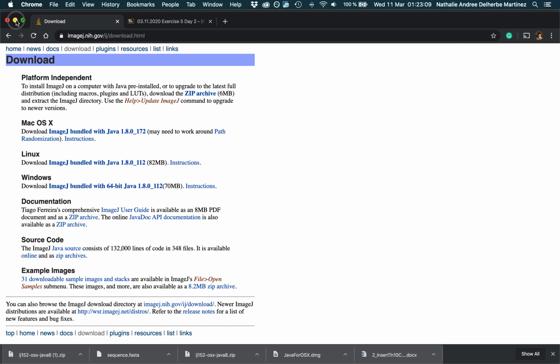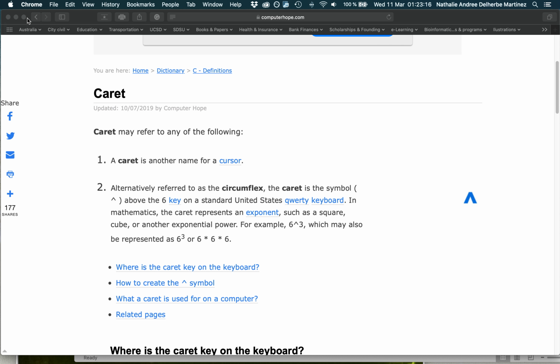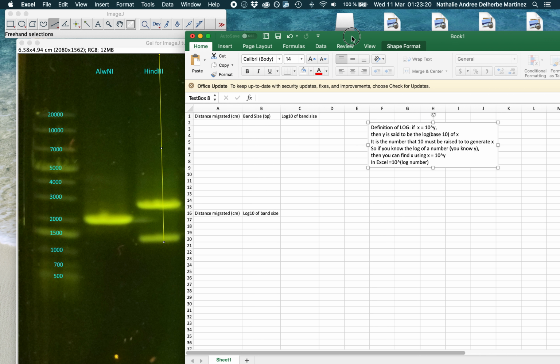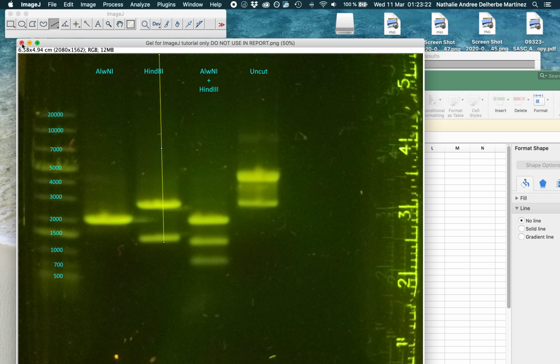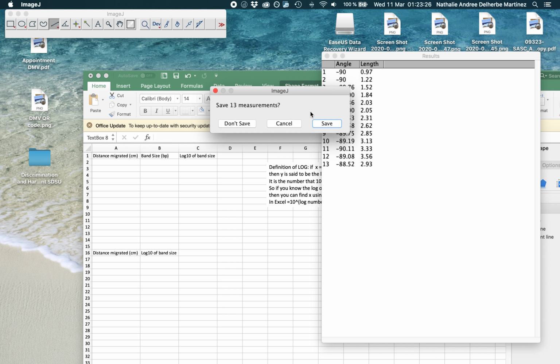Once you have it open, you will close this for a little bit. You will have something like this.